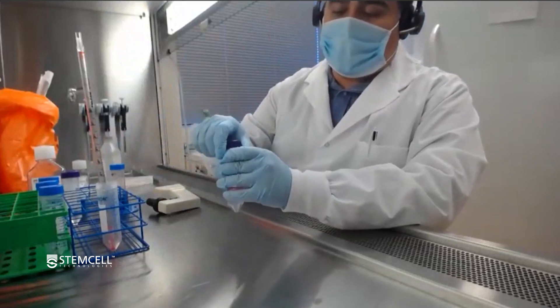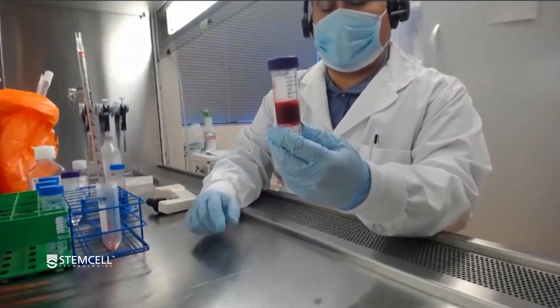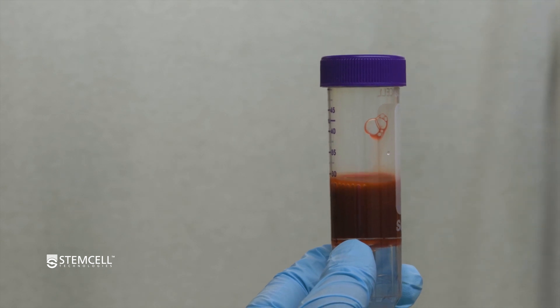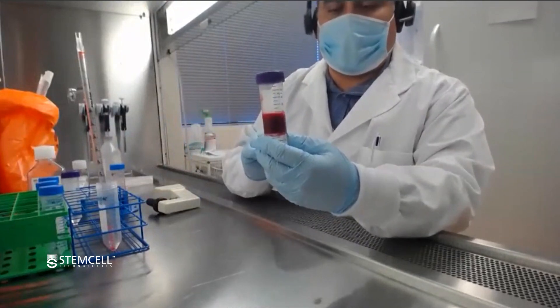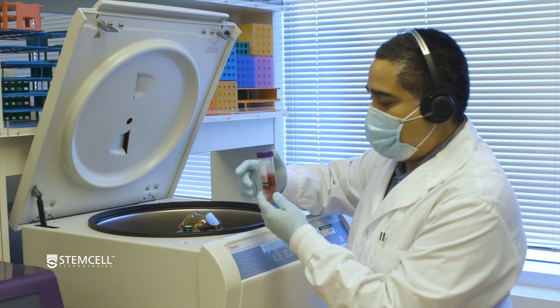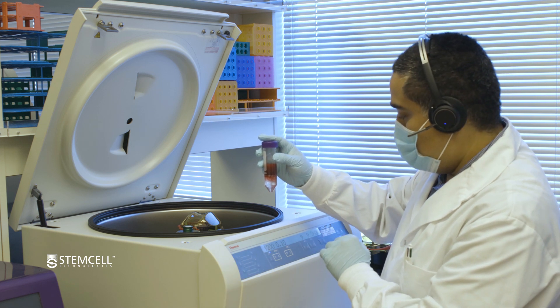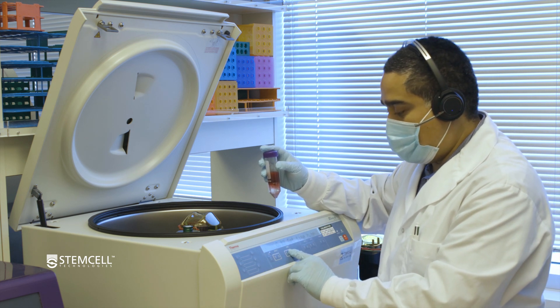In this case, the blood was harvested about 24 hours ago, so it will be a 1200 times G spin with the brake on for 20 minutes. If the blood was fresher — meaning less time had elapsed since it was drawn, say 12 hours or fresher — you could get away with a 10-minute spin. But typically for older blood samples such as this one, I would recommend doing a 20-minute spin at 1200 times G with the brake on. You'll notice that over time a little bit of red blood cells will start to pellet down; that's perfectly normal.